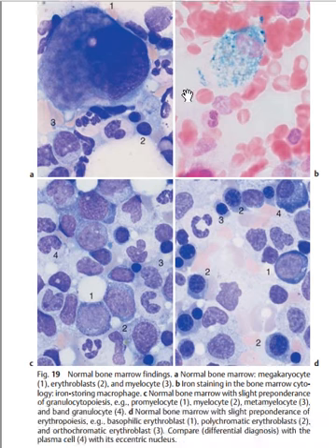Is it clear? Now the next one: this type of stain, I think, is called the Prussian blue stain, used in order to visualize those structures that are storing iron. So it's more of a Prussian blue stain to visualize this type of thing. And this is seen under our tutorials in histology.